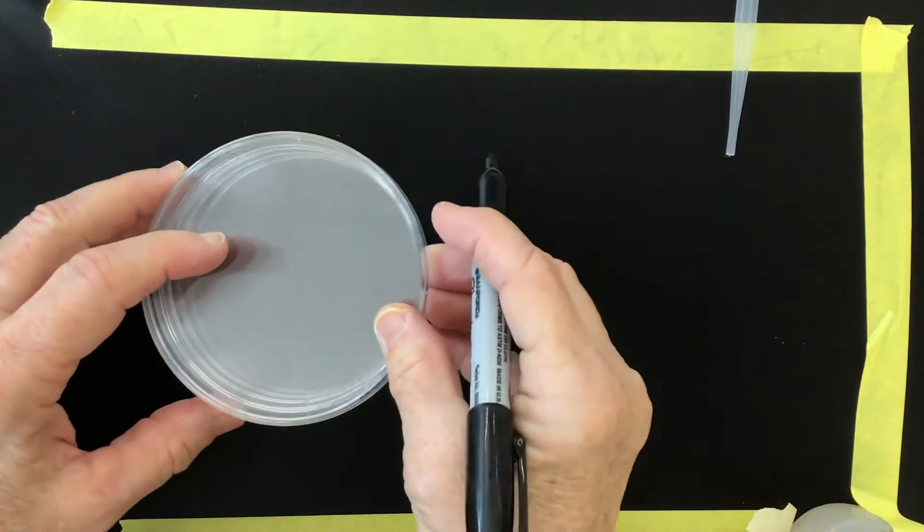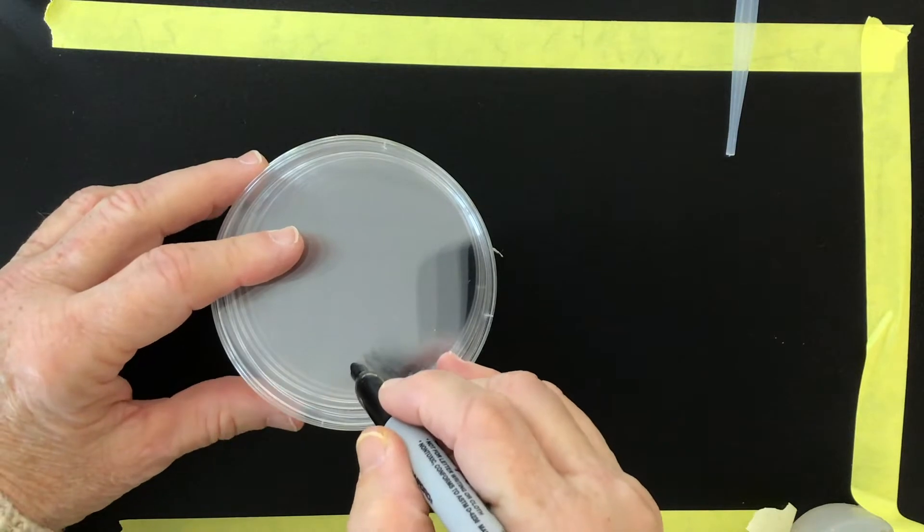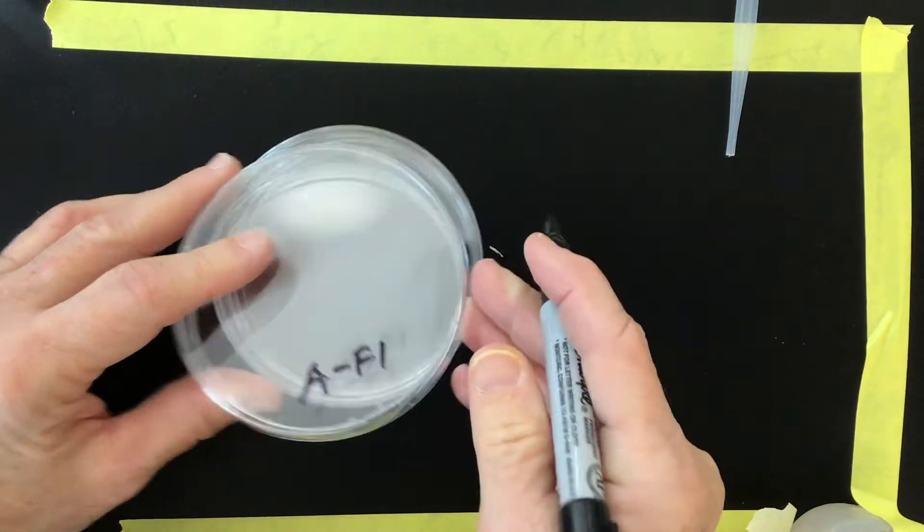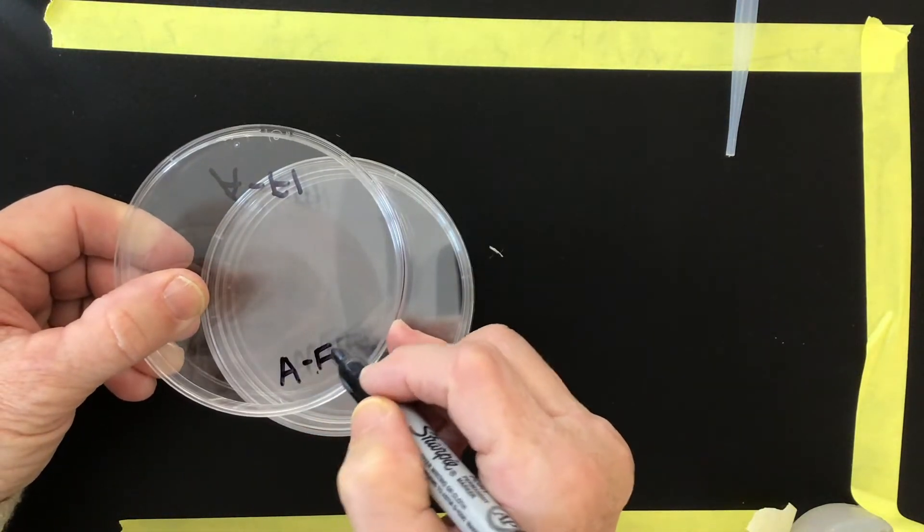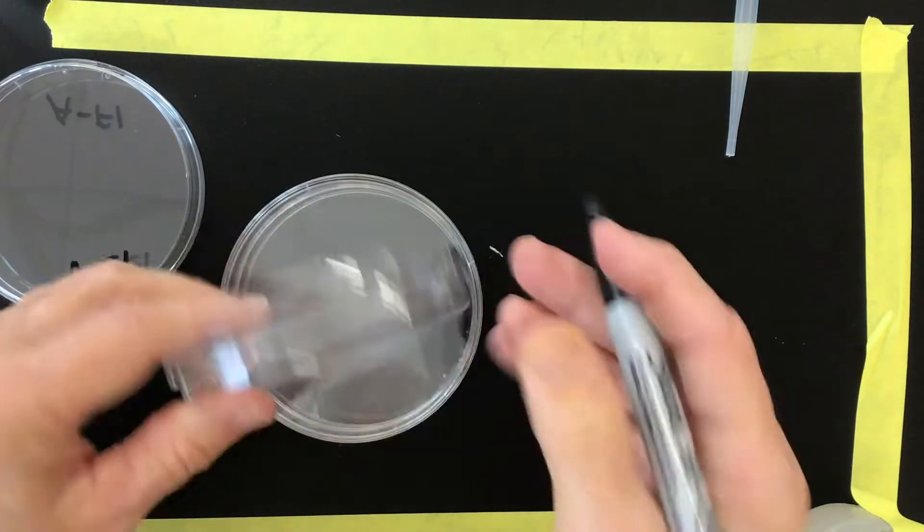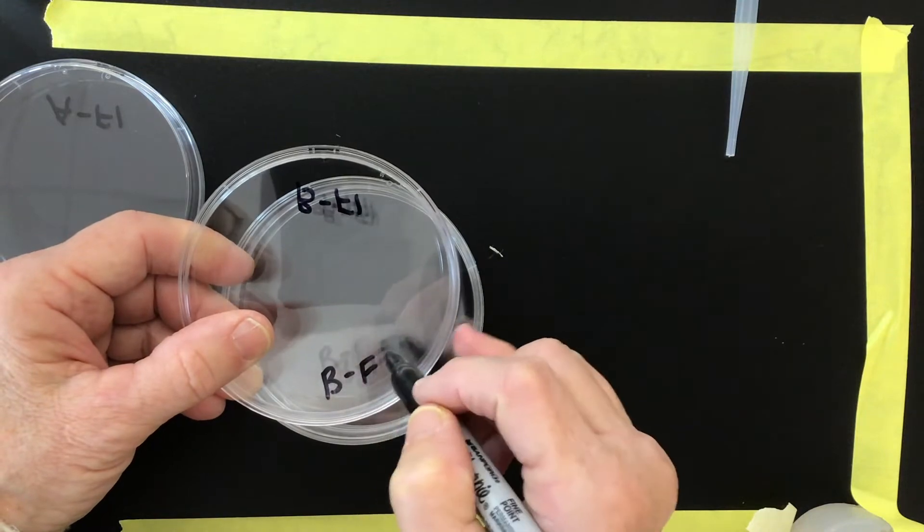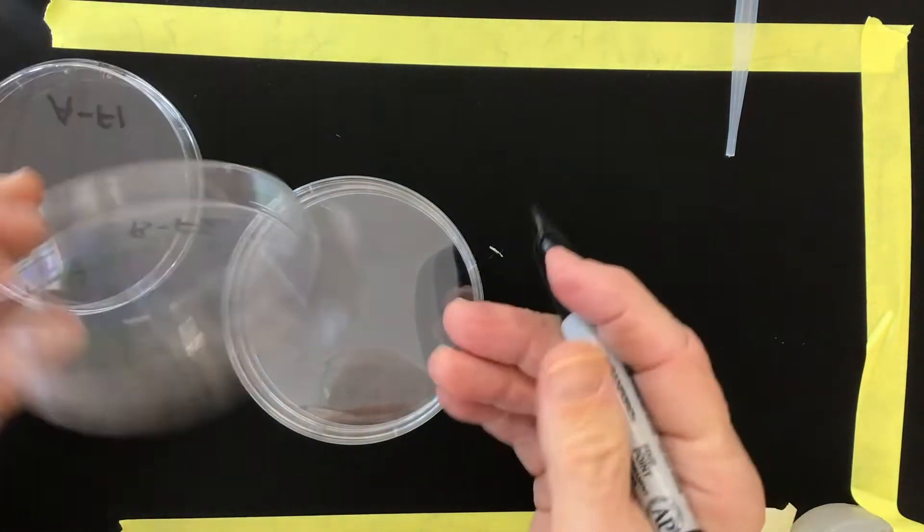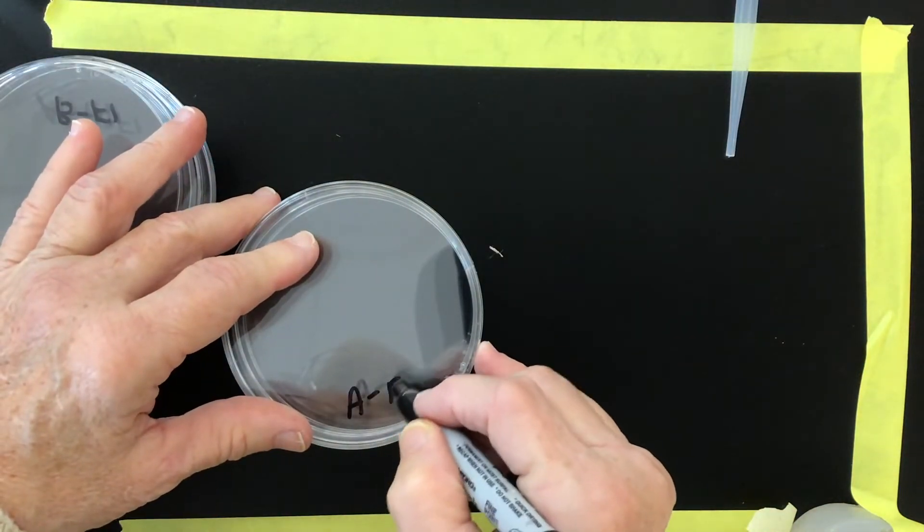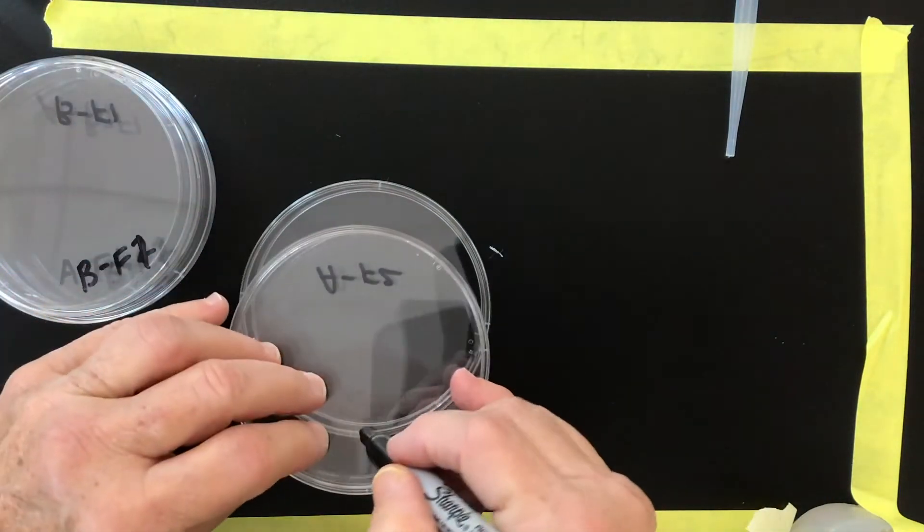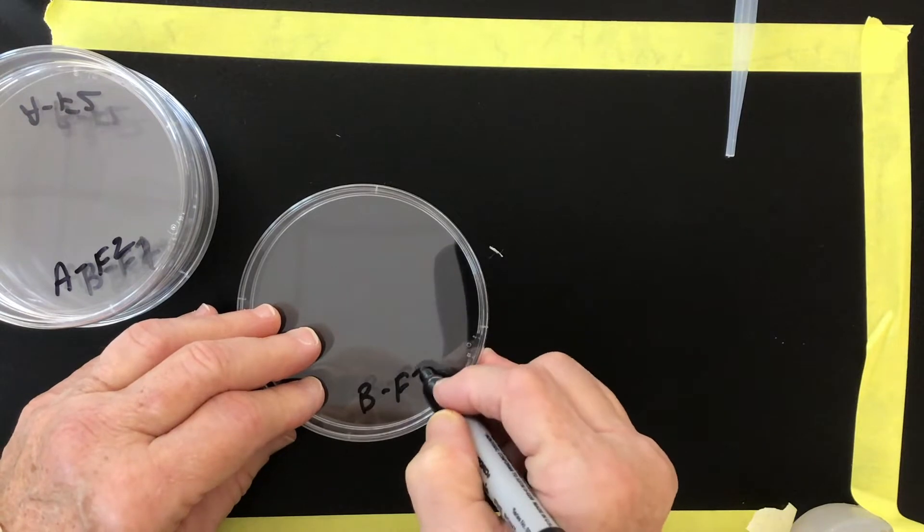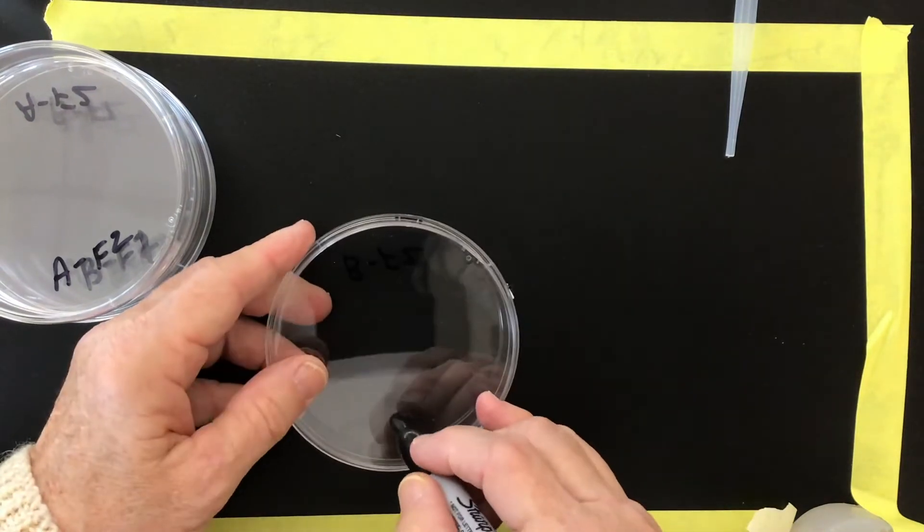Let's start with our petri dishes. The first thing we're going to do is we're going to label them and I'm going to label the top and the bottom. So I'll have an AF1, AF1, BF1, BF2. Better keep that a one on both sides there. AF2, AF2, and lastly a BF2 and a BF2.